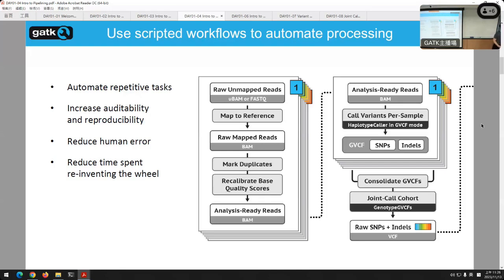When that's finished, it will automatically launch BQSR. So you just have to start one pipeline instead of 3 independent tools. That will save you time, make it easier on you, and reduce the probability of errors. You only have to set up one pipeline.